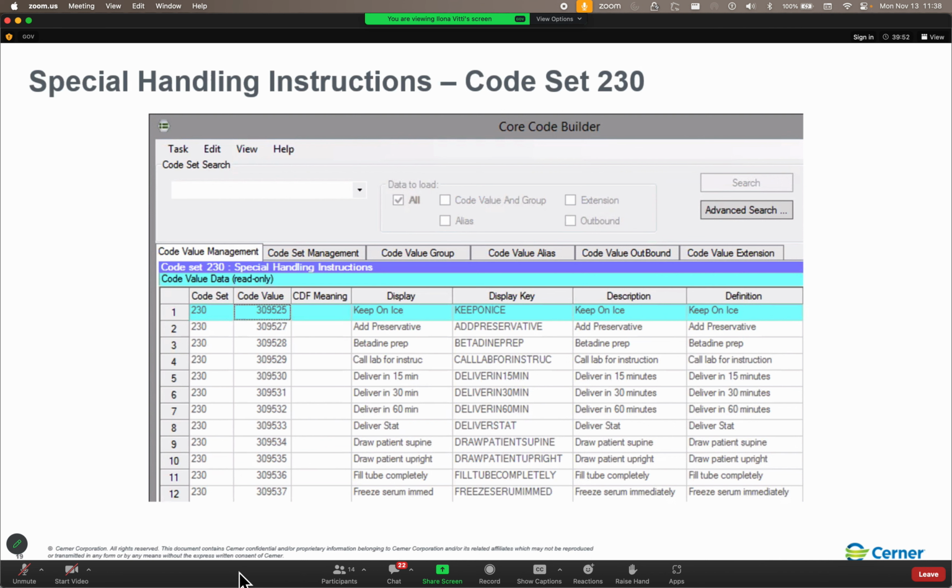You've got 7 fields that are missing. Okay, after last is missing, before first is missing. All right, folks, don't let Krista have all the fun now. Label sequencing, default start time, absolutely. So immediate print always, before first, after last, group flag, time study, add-on, label sequence, those are all missing.